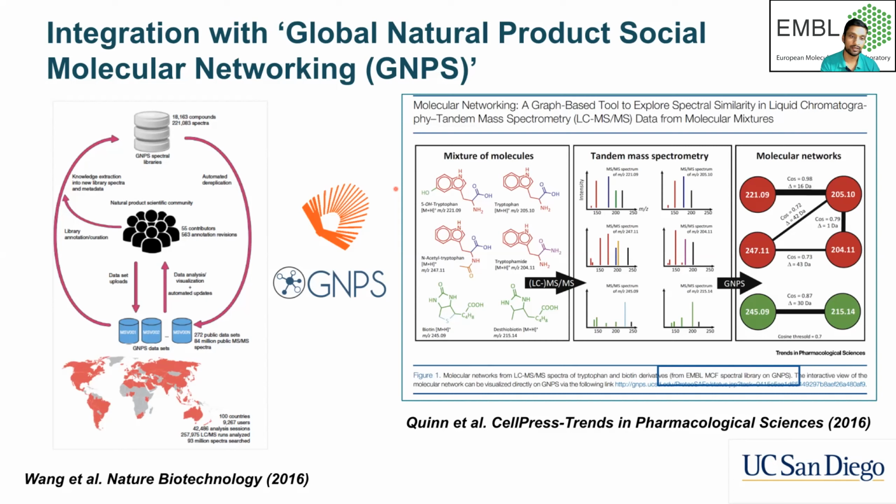You upload your datasets and it will search against all of the databases, including our library, and give you hits. It will give you certain scores showing which metabolites are identified.